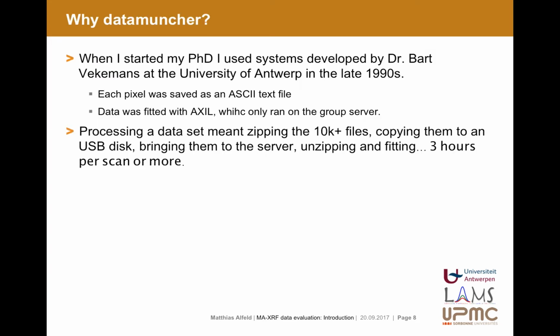So processing the data meant zipping several 10,000 of ASCII files, copying them to a USB disk, bringing them to the server, unzipping and fitting them there, and more than 3 hours per scan were at times needed for this.